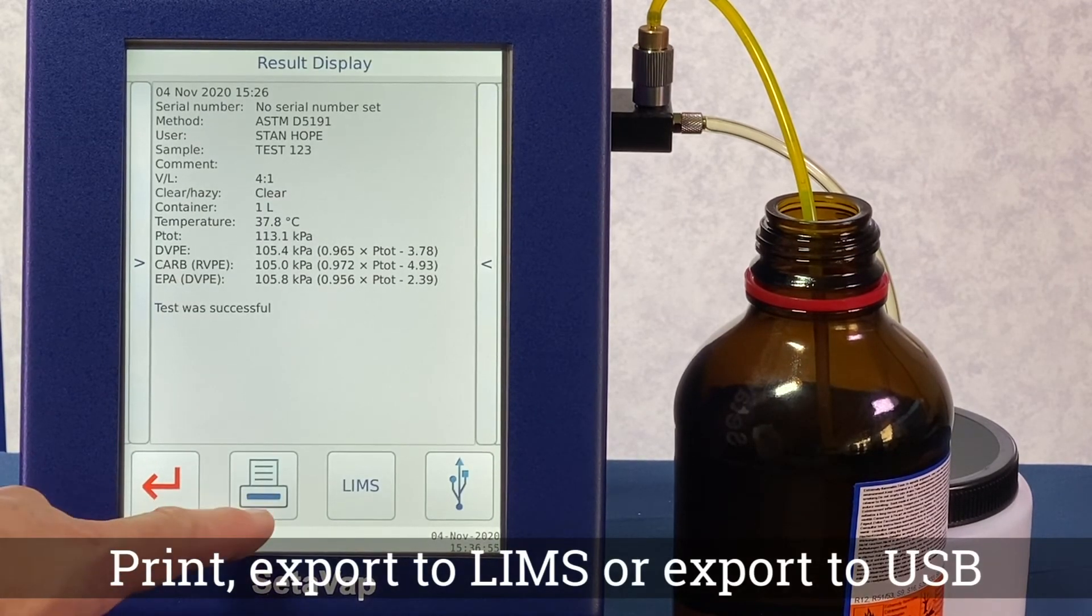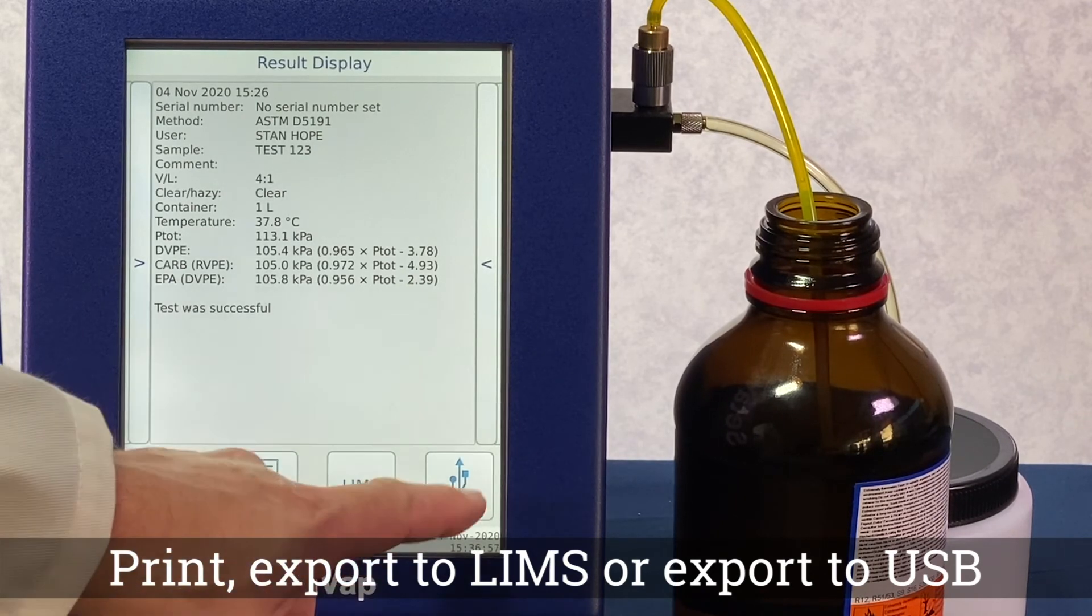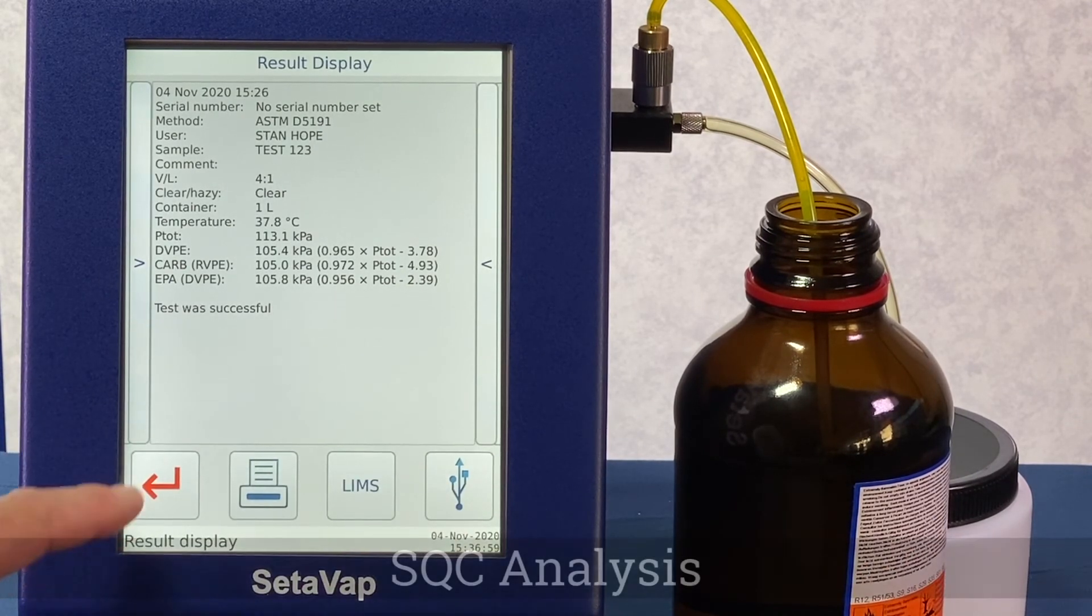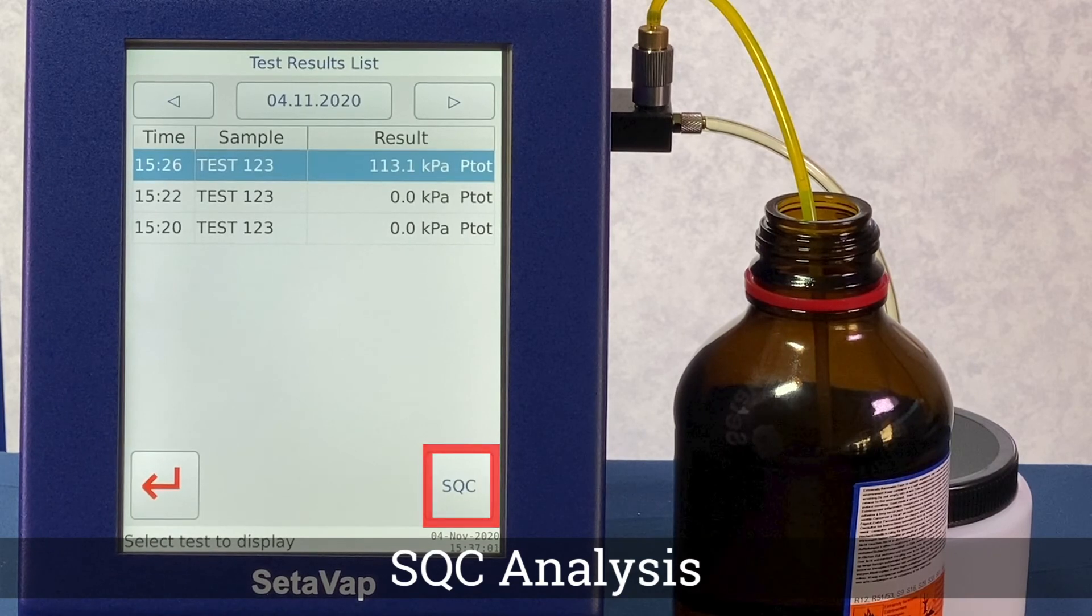Having selected a result, you can print, export to LIMS or export to a USB stick. SQC analysis is available from this screen.